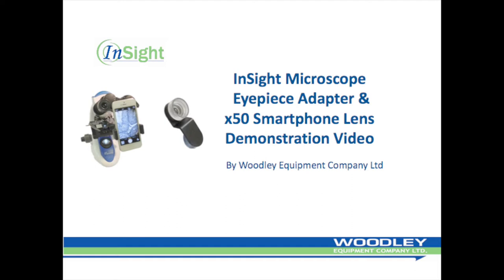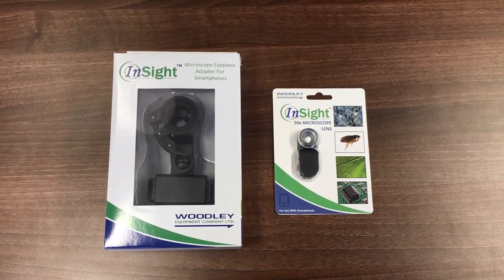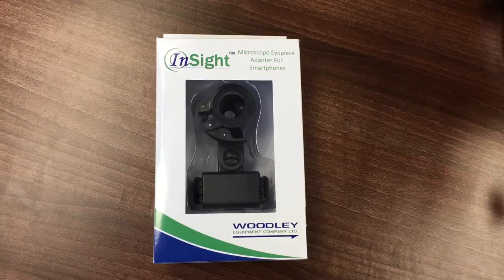Welcome to this Woodley Equipment Company training video introducing the InSight Microscope eyepiece adapter for smartphones and the x50 microscope lens for smartphone. The InSight Microscope adapter offers an inexpensive solution to microscope photography.